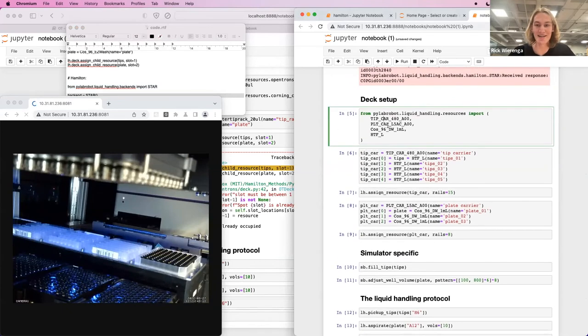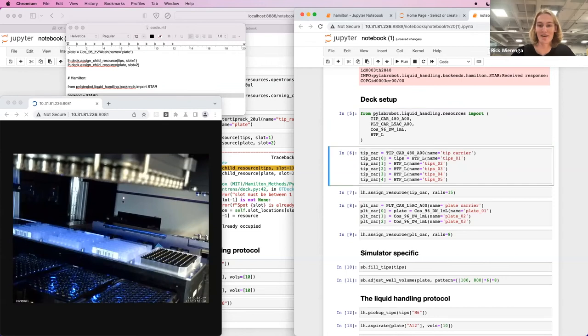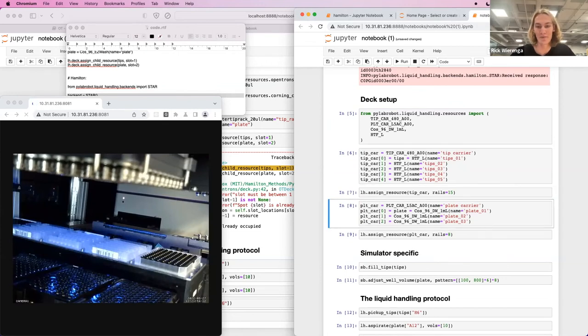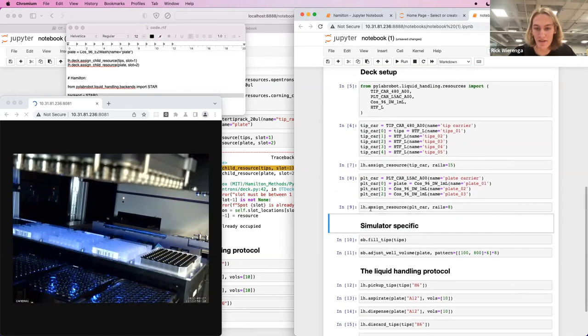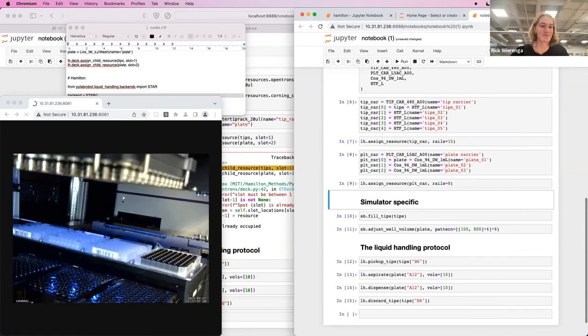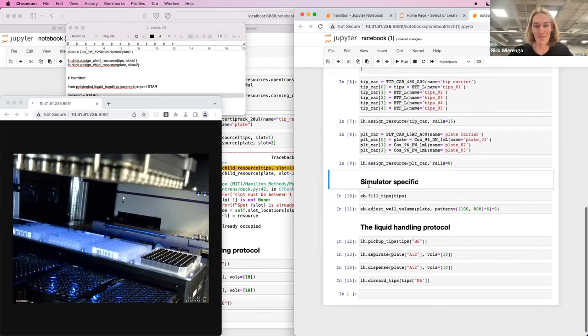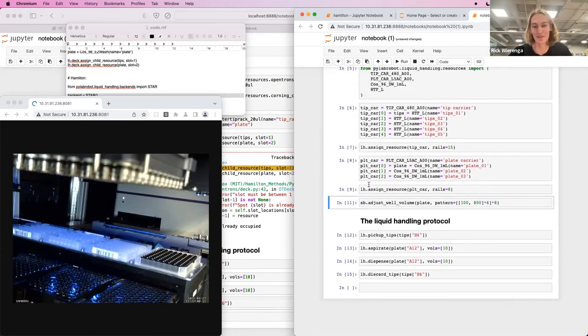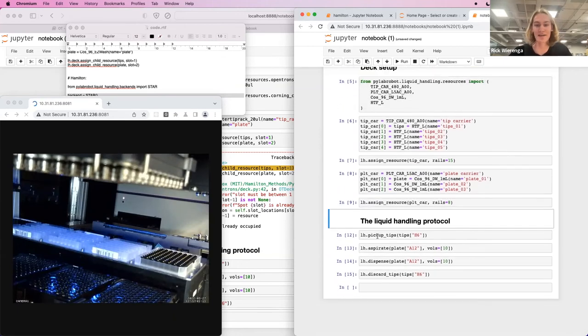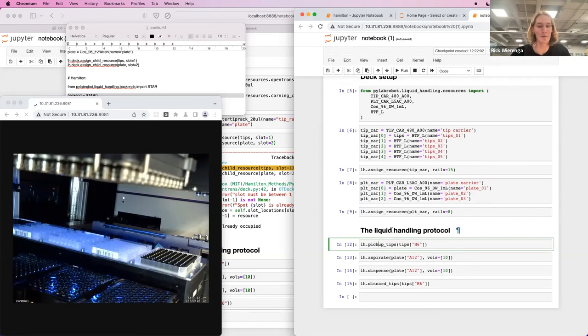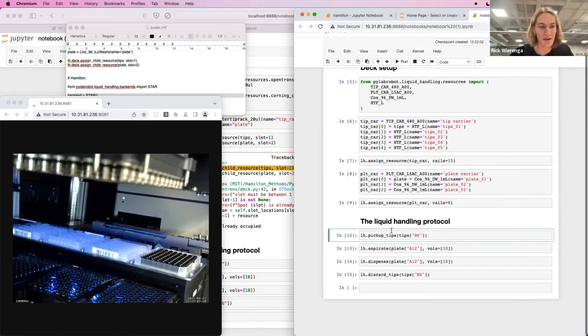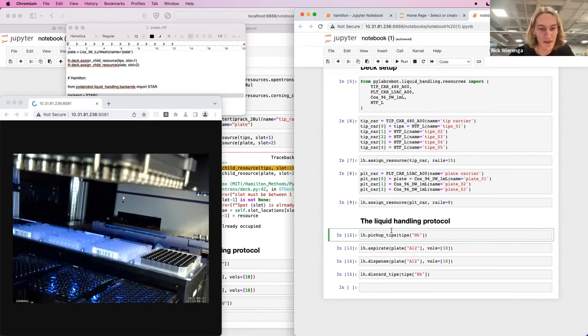As for the deck setup, we can use the same deck setup we used in the simulator. This I have set up in advance. Remove these cells again.